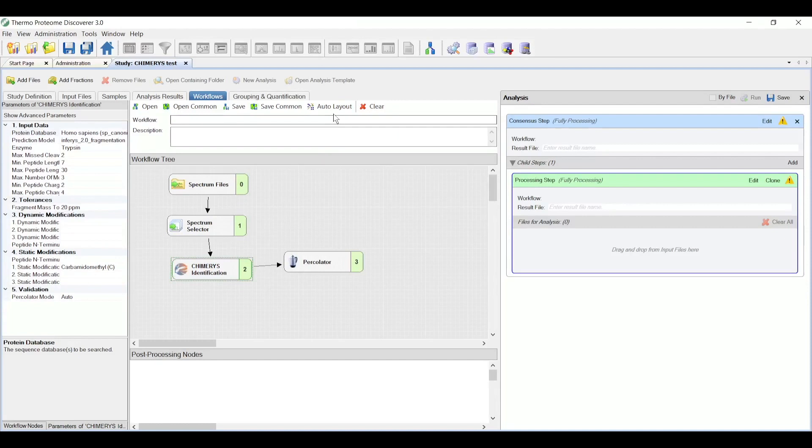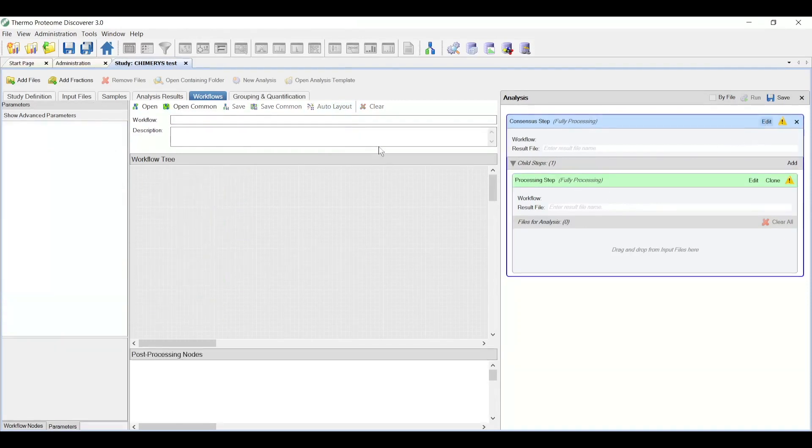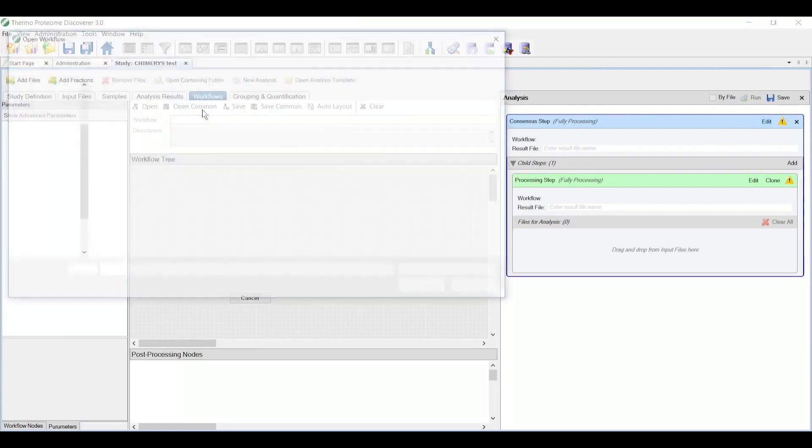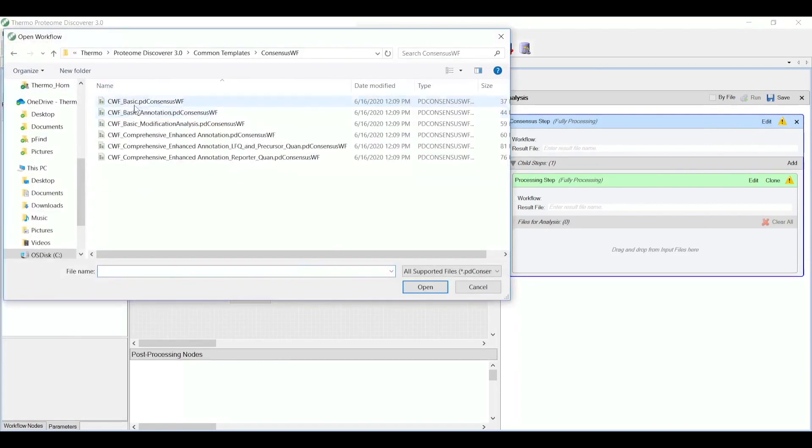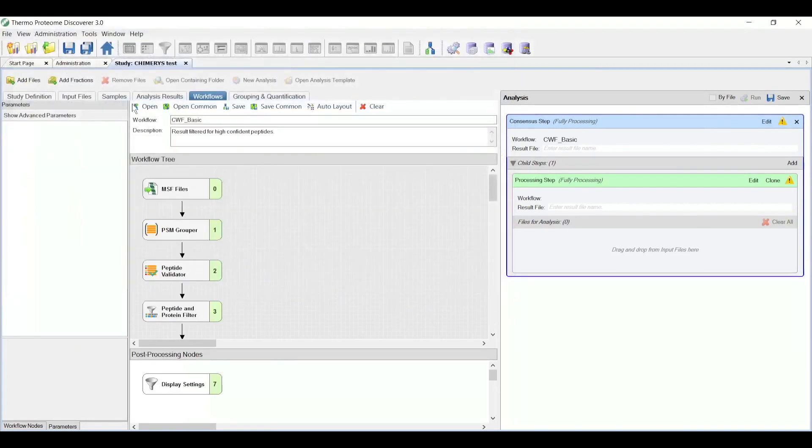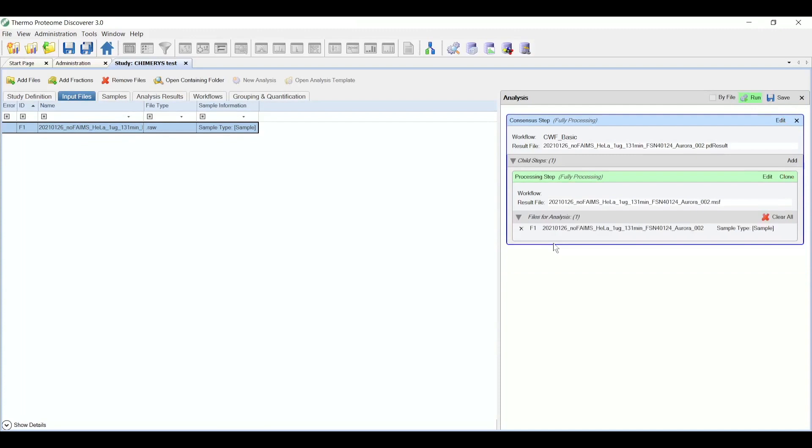I can make this workflow look nicer by clicking on auto layout. And next, I need to choose a consensus workflow. In this case, I'm going to choose a common workflow, a basic workflow. And now I'm ready to start the search by dragging in the data file into this files for analysis, and then clicking the run button, which will queue up both the processing and consensus steps onto the run queue.